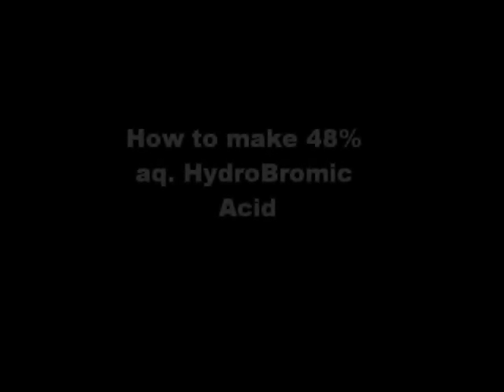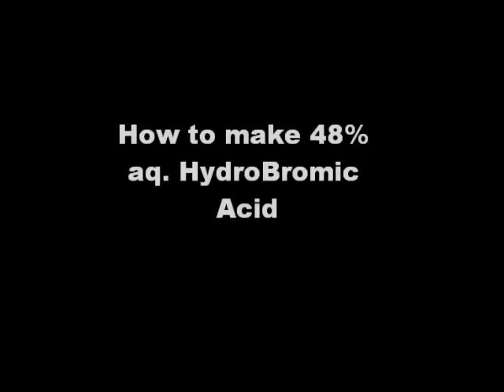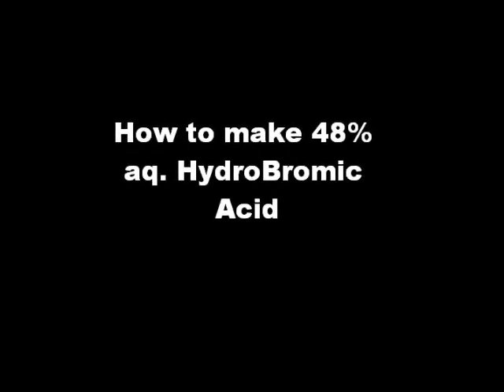Hello YouTube. Today we're going to make some 48% aqueous hydrobromic acid. This acid is used in organic synthesis and I plan on using it in future videos, especially for dehydrating alcohols.